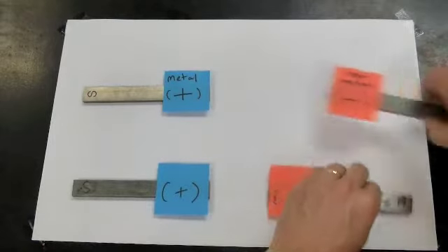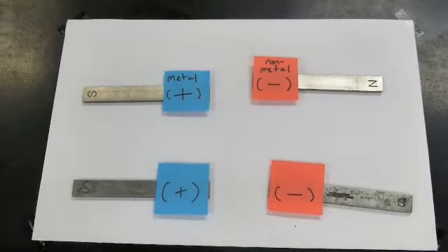So starting with one combination, if all the ions are present in the solution, if they rearrange to form new compounds, we'll try to figure out what new compound was formed so that we can determine which element was involved in that reaction.